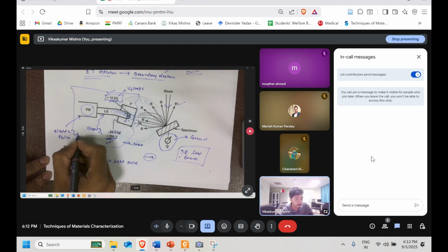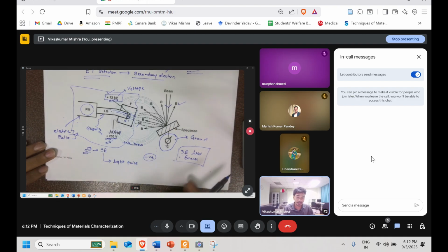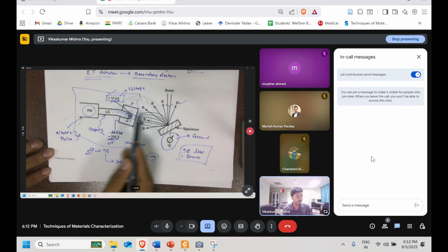So we got this electric pulse. Now this electric pulse, we will be able to detect it on the screen. Okay. So this is how the entire scenario has been played. We had the electron, we got the signal from the specimen, that SE signal having the low energy. First we applied the bias to the cage so that this SE electron gets attracted to it.